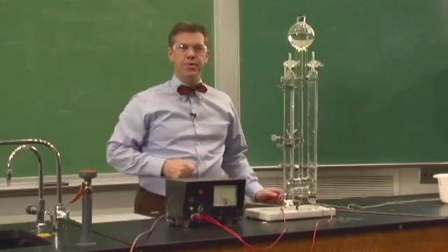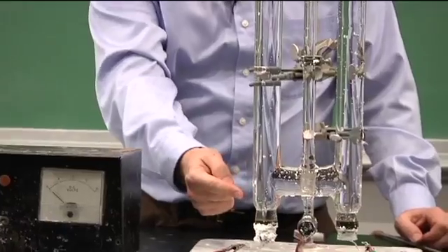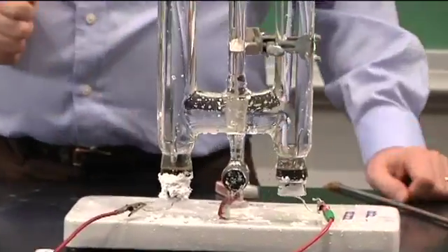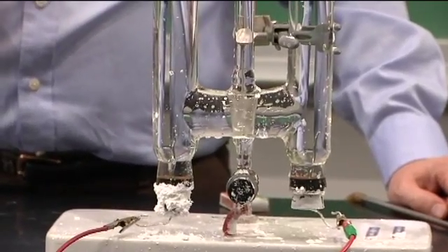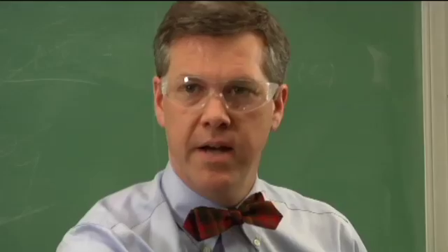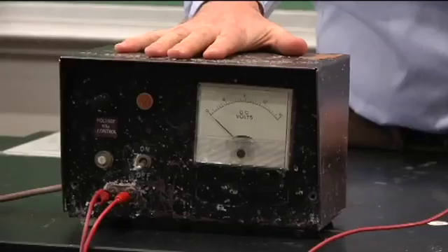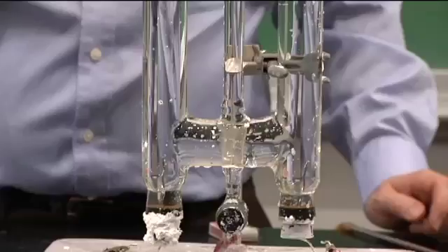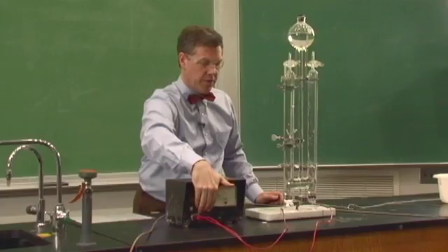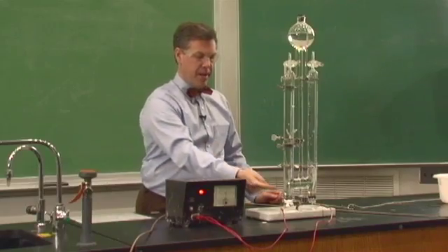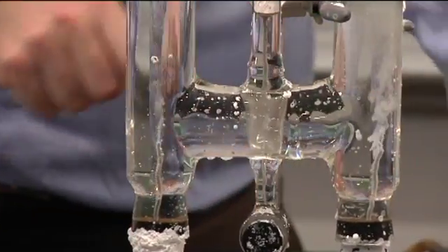Here I have a tube with water in it, and at the bottom are two electrodes that generate positive and negative voltages. I have a power supply here. Right now we just have water, but when we turn on the current, we see bubbles starting to form at the two electrodes.